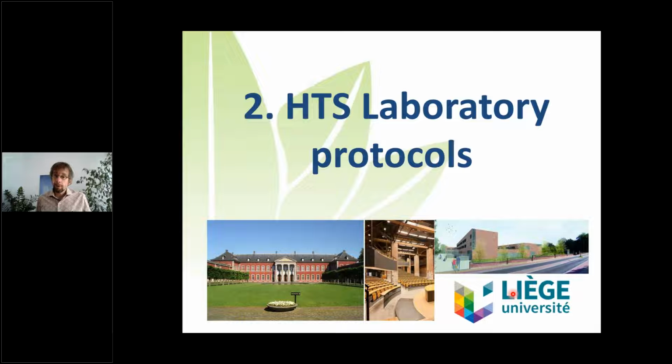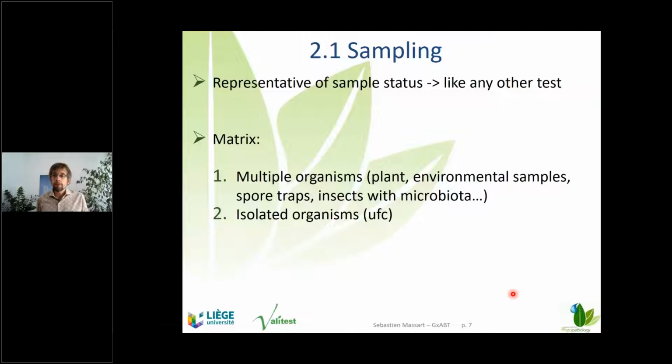So let's go first to the laboratory protocols. Laboratory protocols start with sampling. And sampling, I mean, there is no difference with any other test. You have to take a sample that is representative of the plants, of the field, of the batch that you are sampling.